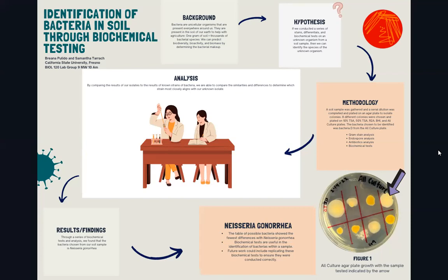So for our hypothesis, we hypothesized that if we conducted a series of stains, differentials, and biochemical tests on an unknown organism from a soil sample, then we can thoroughly identify the species of an unknown organism.